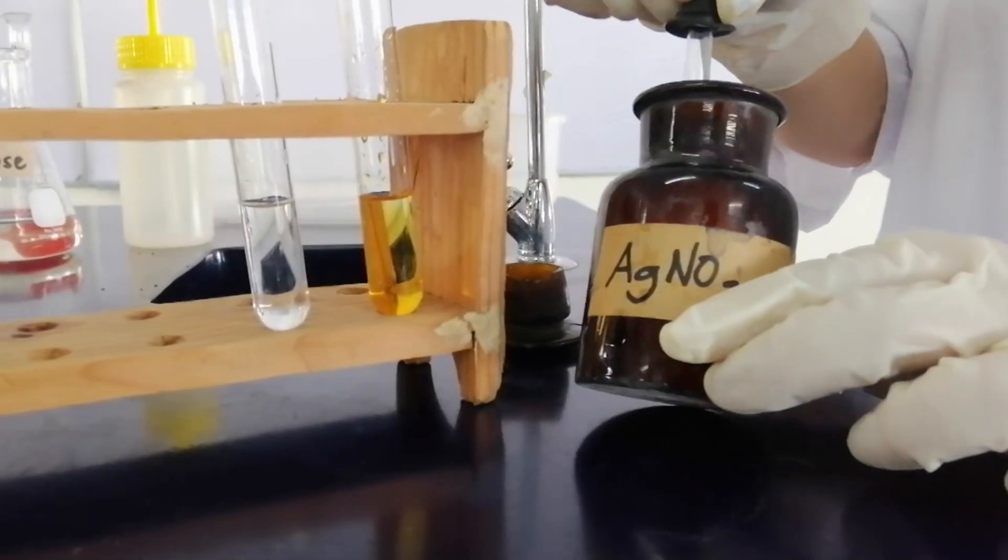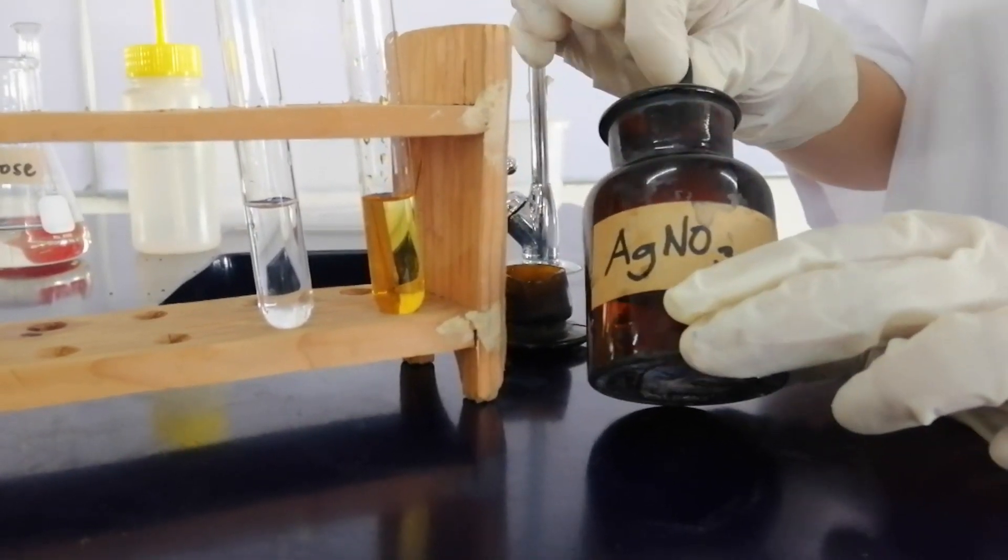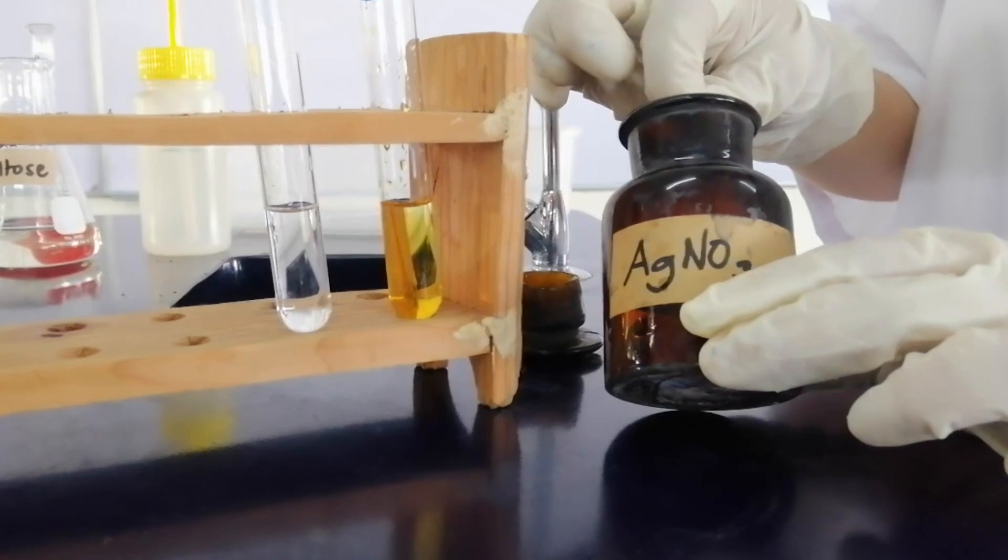We add a drop of silver nitrate. The formation of a white precipitate indicates the presence of sodium chloride.